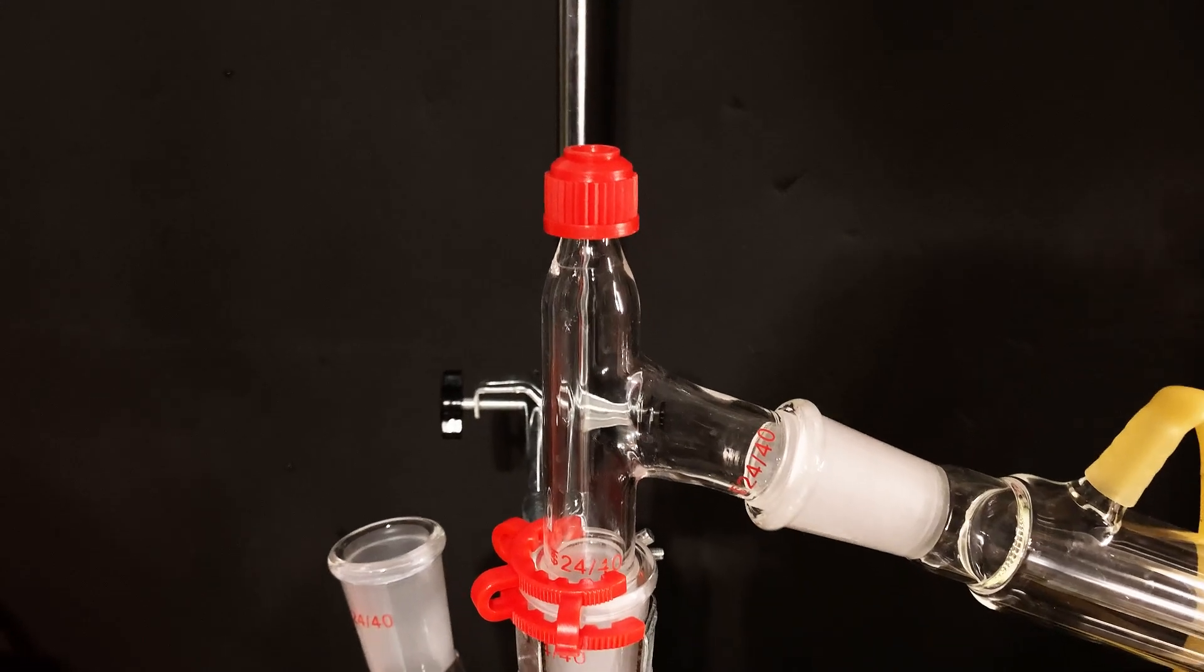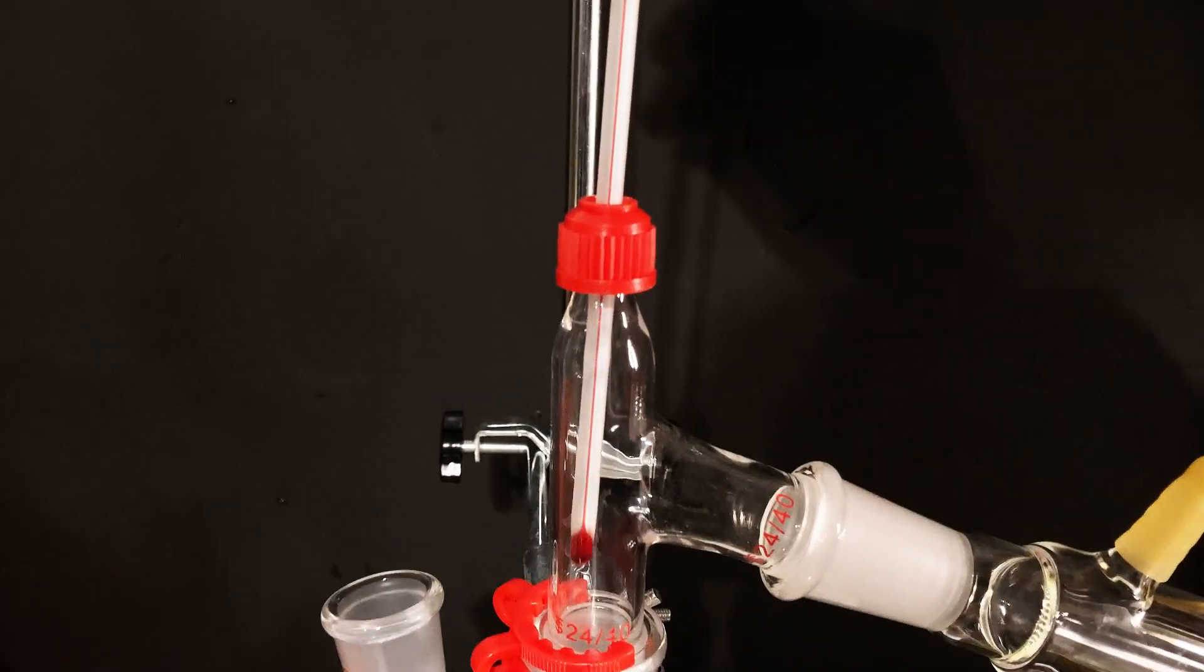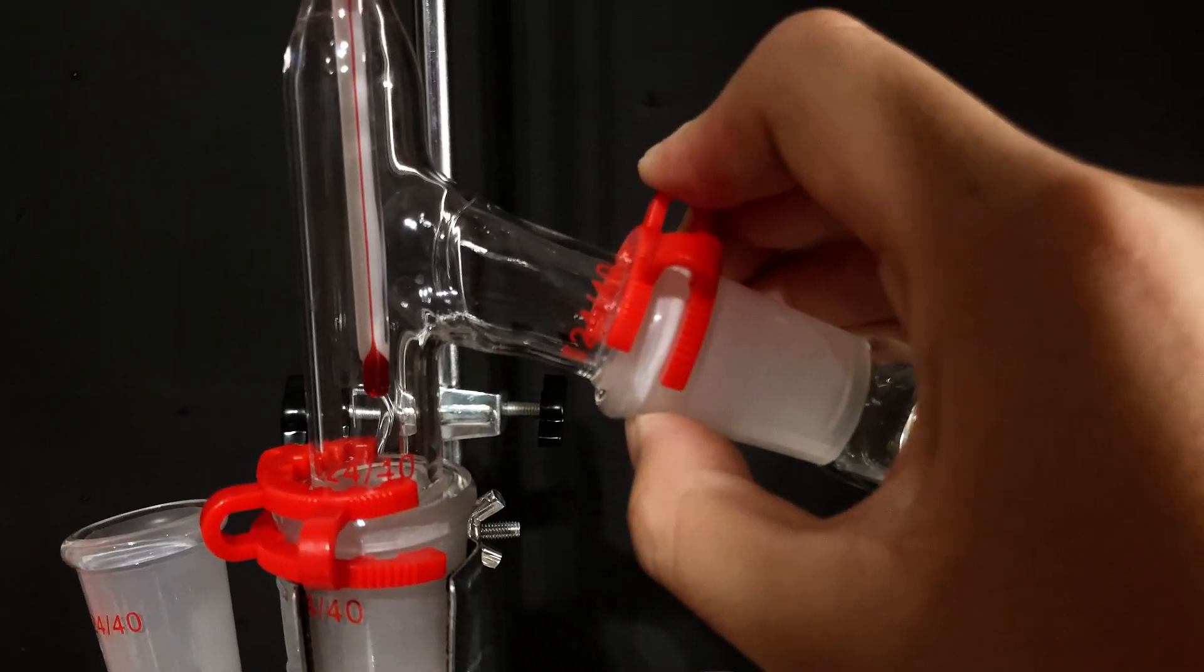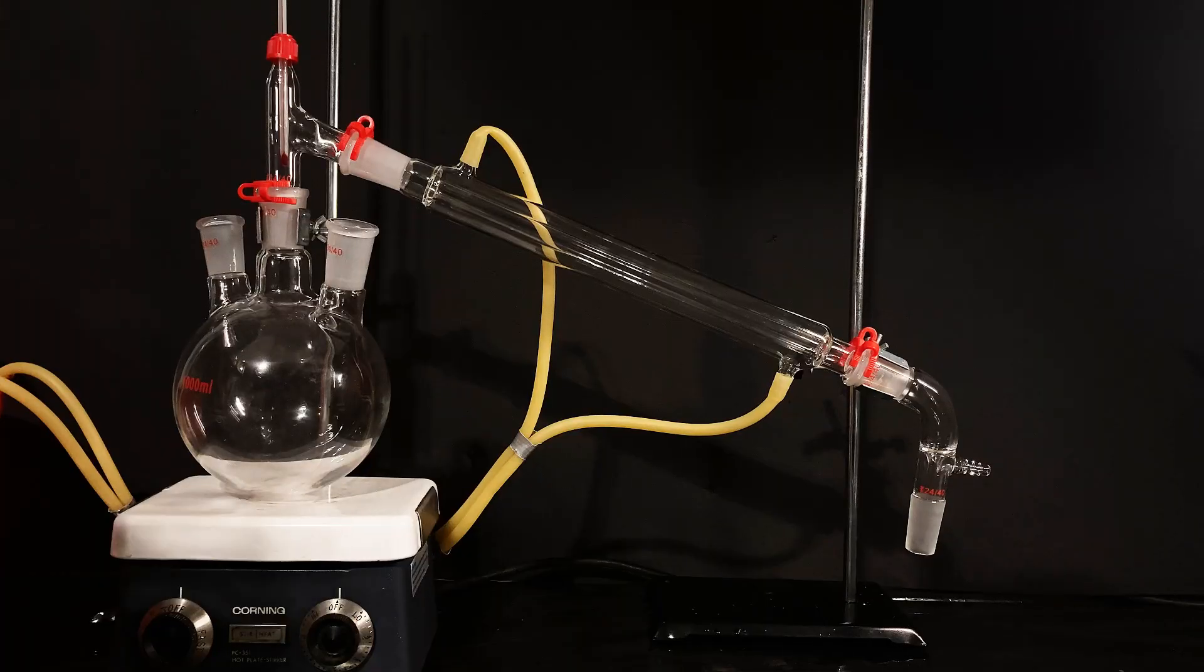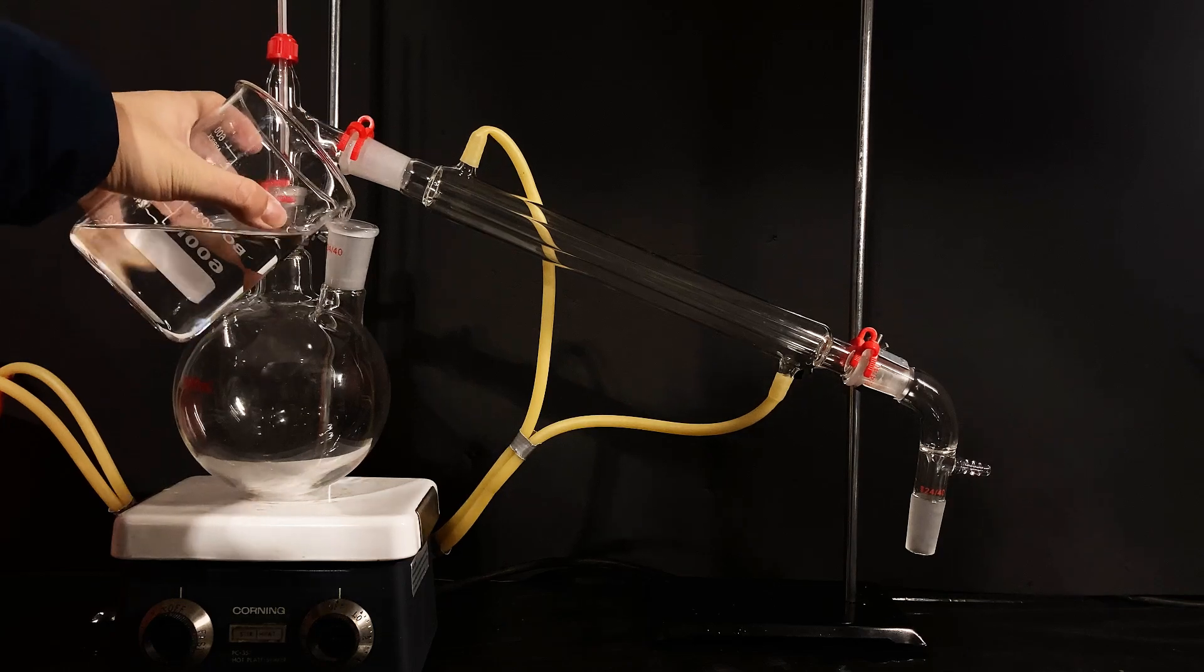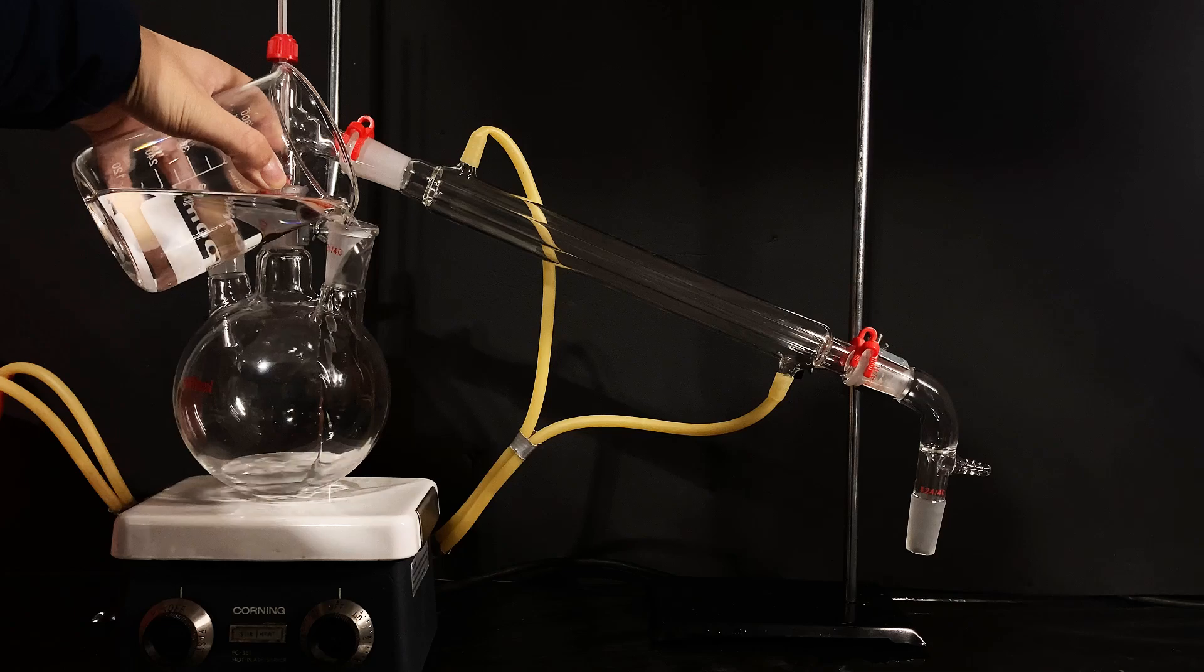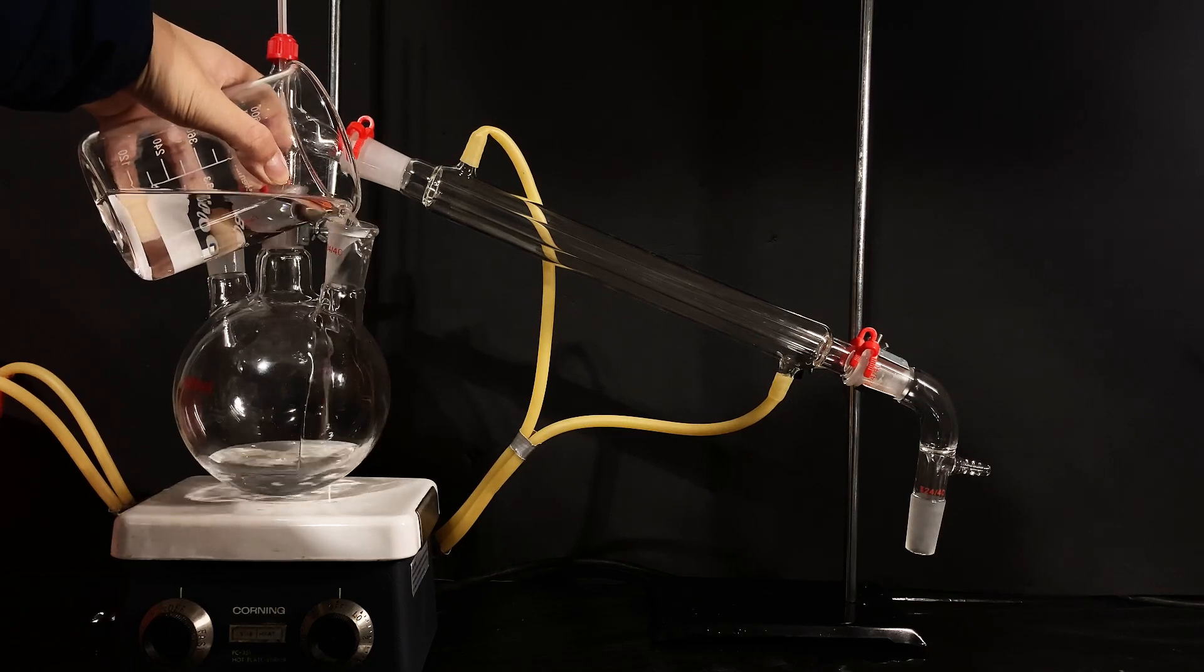If you're asking what that means, an azeotrope is essentially when the concentration of the substances are the same in the vapor phase as the liquid phase, and are inseparable by simple distillation. The two substances act as one, and in this case, it has a lower boiling point than either of the two substances.